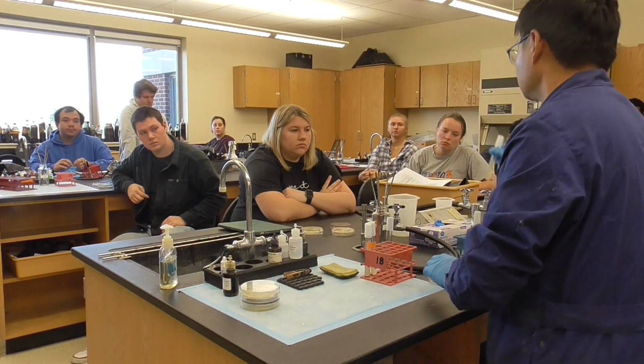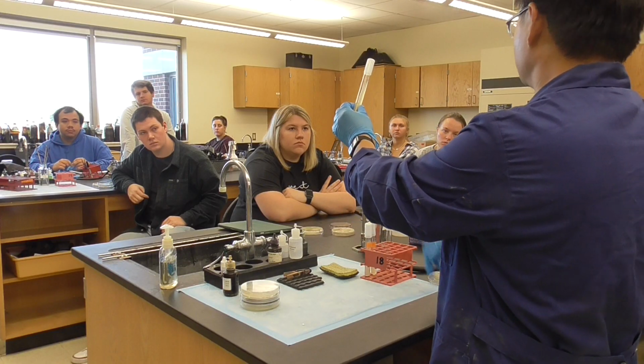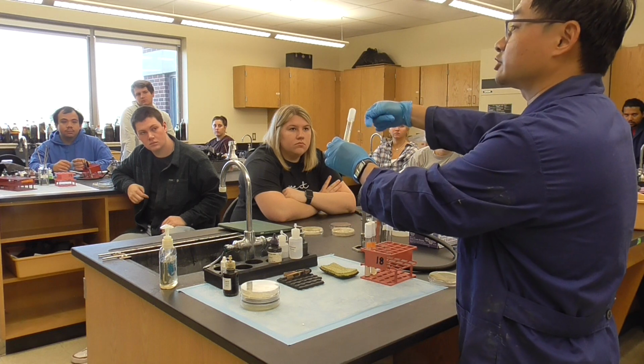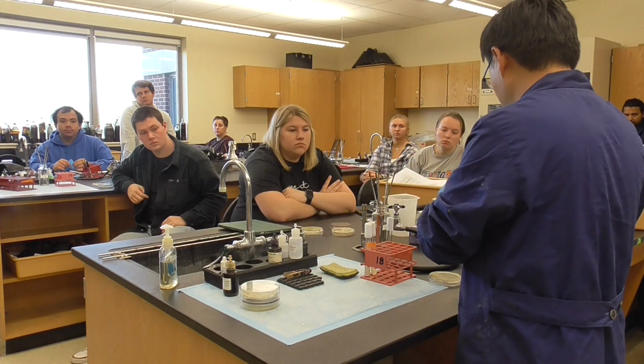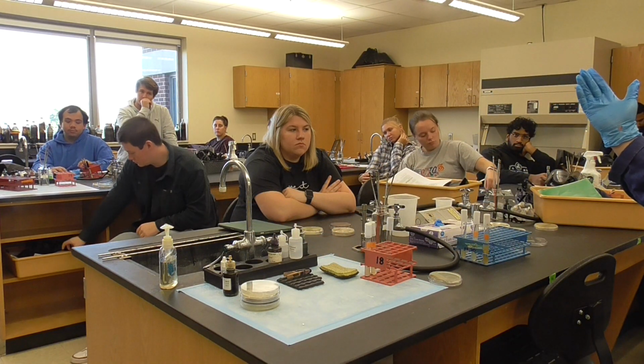Okay, what's the last one? Phenylalanine deaminase test. This is easy. Use a loop, inoculate the bacteria to do a zigzag streak. Okay, like we did before. So I just demonstrated to you briefly. Okay, any questions? Is it clear?